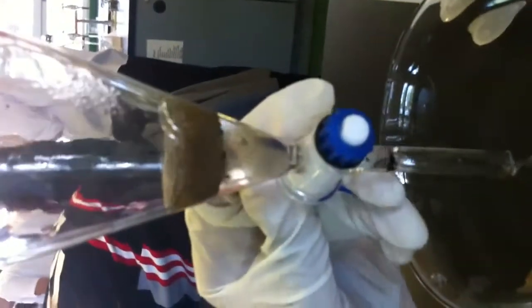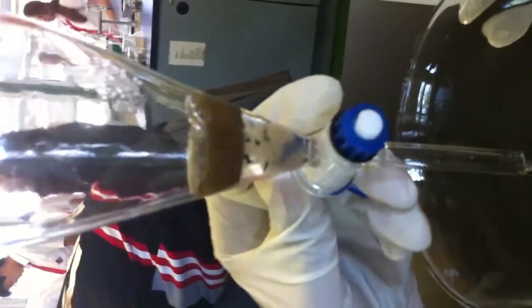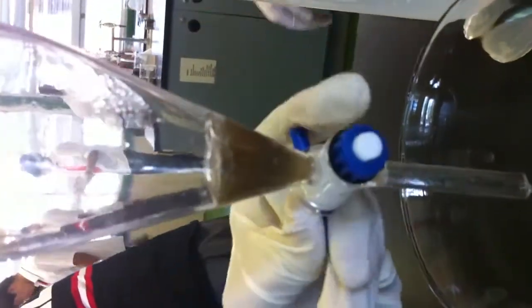No, not that. You open the top if you want to let go of some stuff. You open the top lid. Open it. But watch. No. You can't open it and do that because that's going to go really fast. Okay. Patrick, open the lid. So stop it right there. Okay. Now keep going. Open the lid. No, you leave the lid open. Karnik's going to close it down. No, a little bit more. Stop. Stop. Yeah, flat. Done. Make sure that's closed completely.